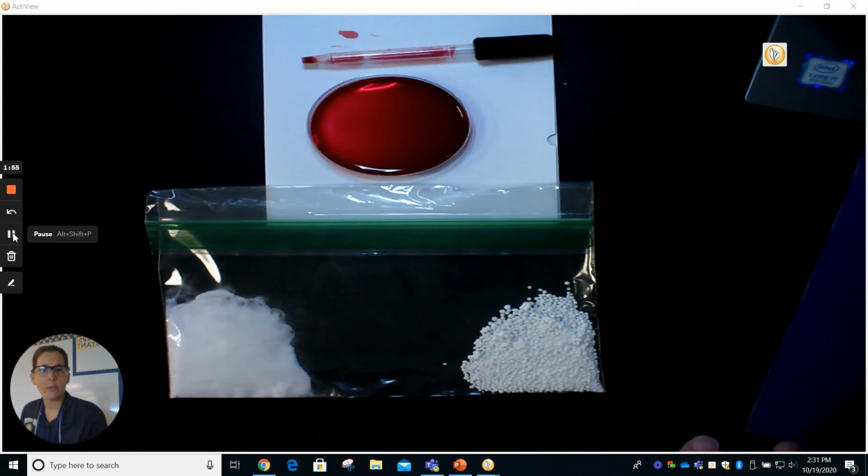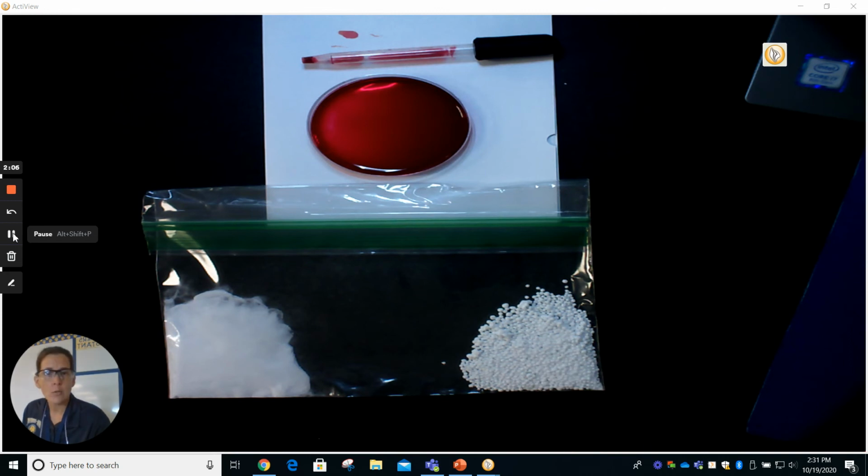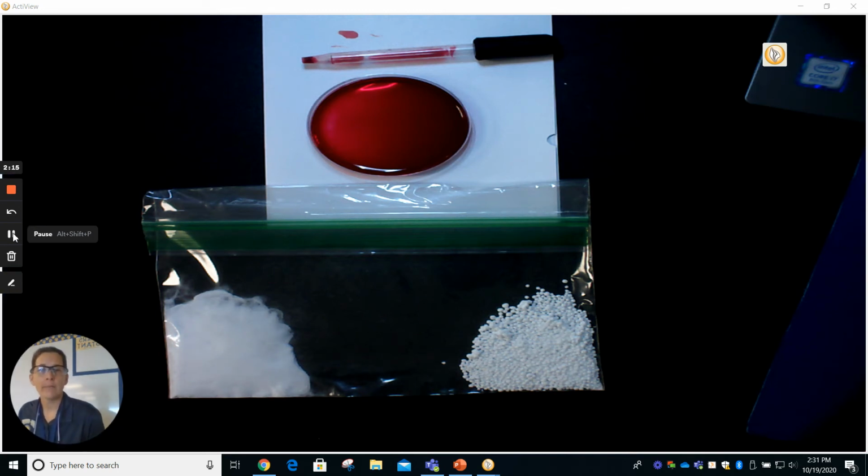All this is pickling crisp. So if you have ever been around anyone who cans, like if you have a garden or maybe your grandparents had a garden, and they made pickles, this chemical right here would add crispness to your pickles.